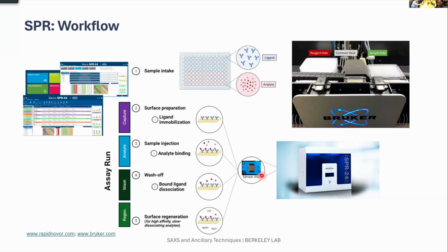So the things that we are using in our lab is NTA-based attachment, where we have His-tagged protein and it is attached by nickel NTA to the surface, or streptavidin-based chips where we can attach biotinylated molecules as well. So you kind of precisely know where your label is, and you can attach it knowing that your binding site or any active site is safe.